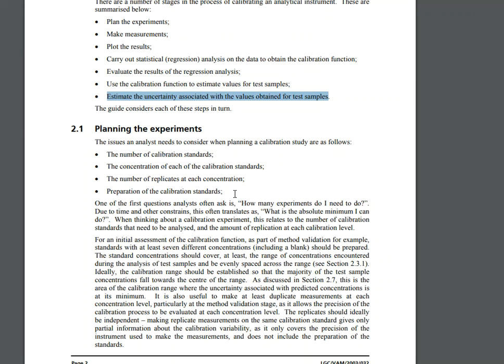Hopefully you'll stay away from serial dilutions. We've talked about that, right? And hopefully you'll start with a primary standard that has been certified, and you make your standards based off of that primary one.